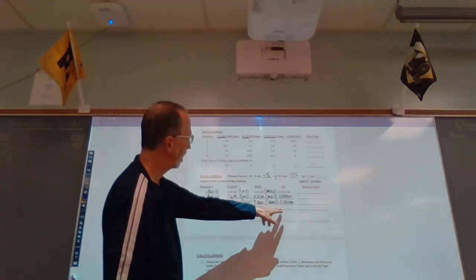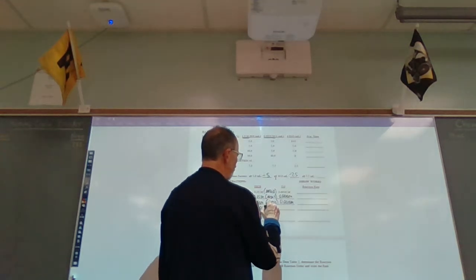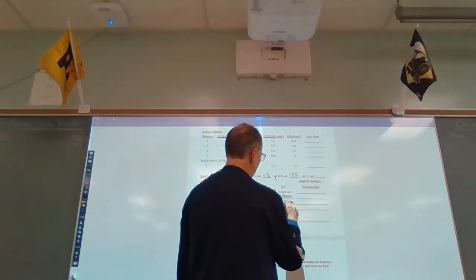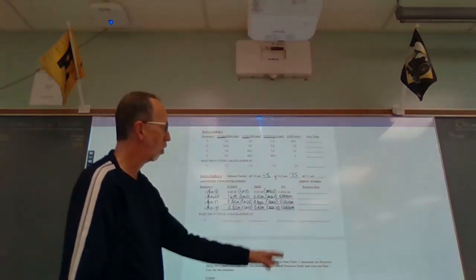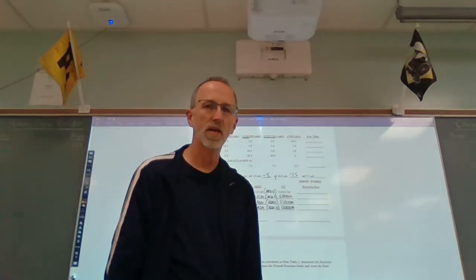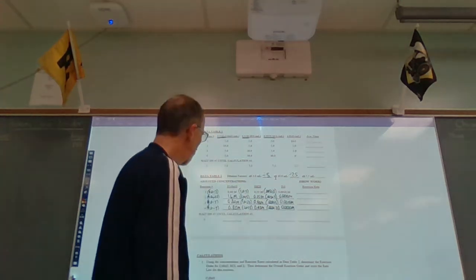And then we have 10 over here in the iodine. And so that original concentration of 0.0050 molar divided by 2.5 gives us 0.0020 molar. Okay. Again, water, we don't really care. Water is just the substance that brings the volumes equal for all the solutions, which is necessary to do.